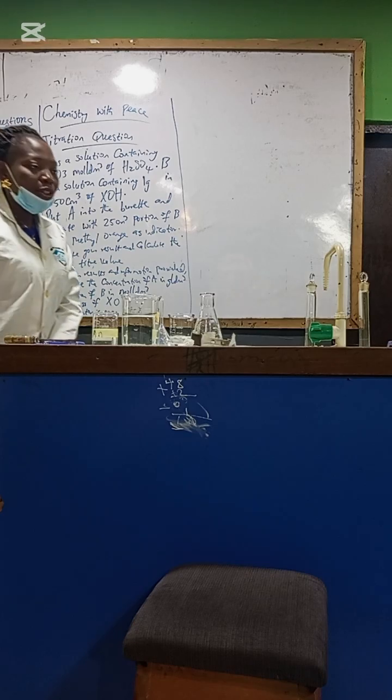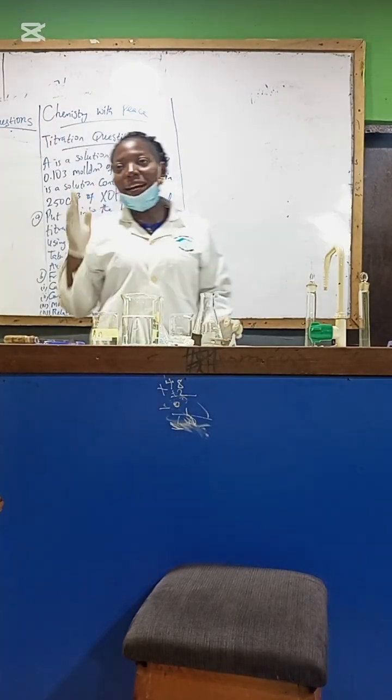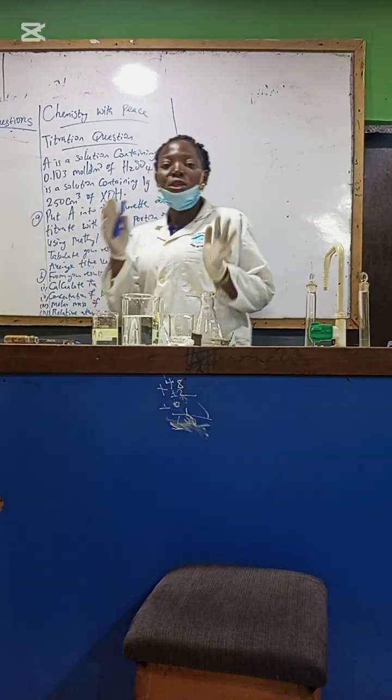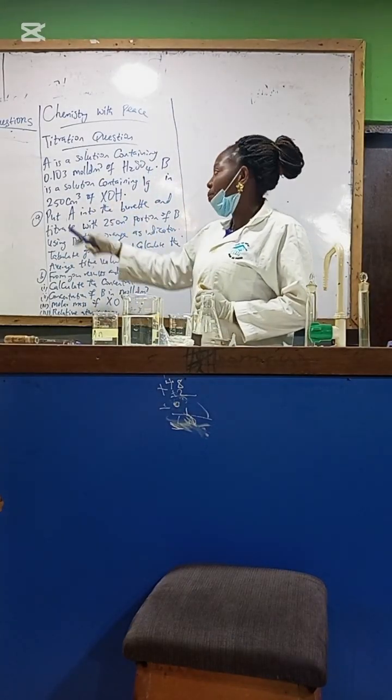So still in preparation for the WAEC Practical 2026 Chemistry, we're going to do titration. Here is a question on the board.